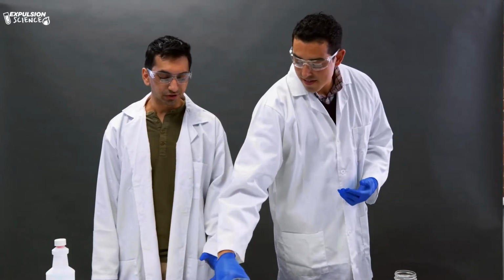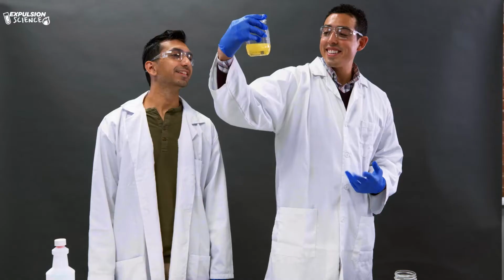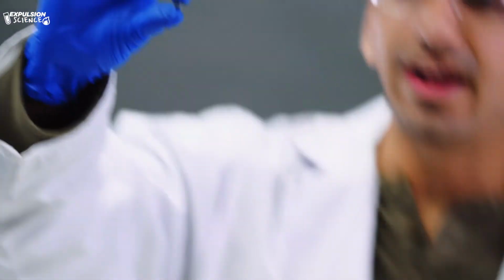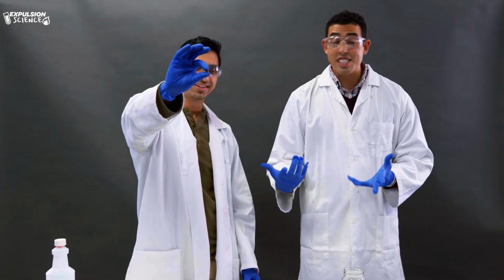All right, and then our showstoppers. So we have iron. Yeah, it's definitely melting away. Yeah. Creating a lot of hydrogen gas and iron chloride. We showed it reacting to zinc, and I want to show you guys real quick. We pulled it out a little early, but you saw, now this is all that's left. That was after about 30 seconds to a minute.